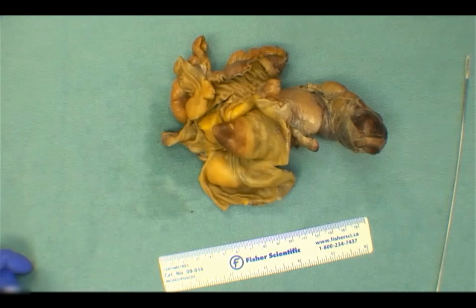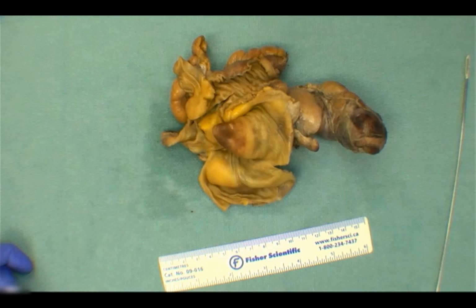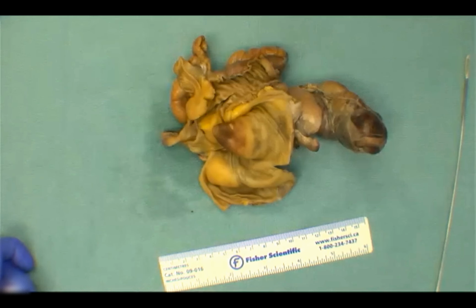When it comes to the appendix, what would be your approach? If this came across your bench today, would you be putting this appendix through in toto? Yes or no, or you're not really sure? Maybe you're going to phone someone, or maybe there's a different approach from where you're at. So let us know what you would do in this case. I think there's a clear preference here.